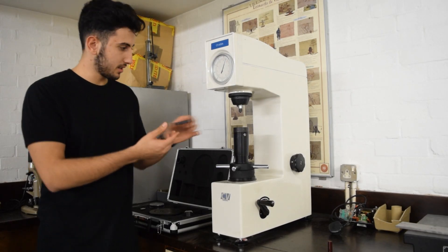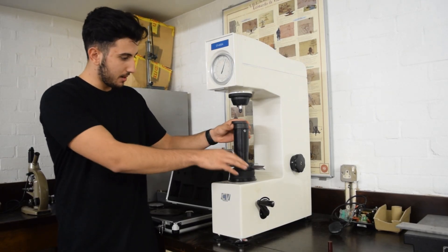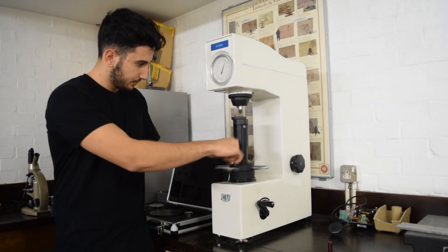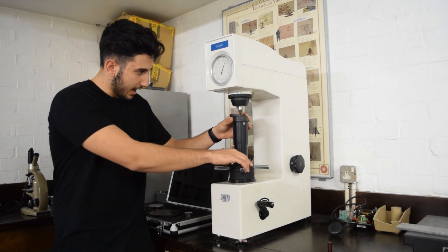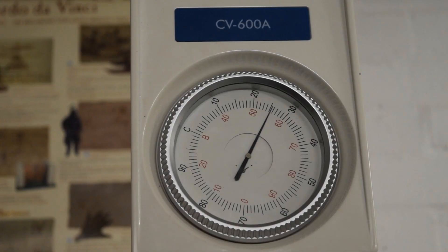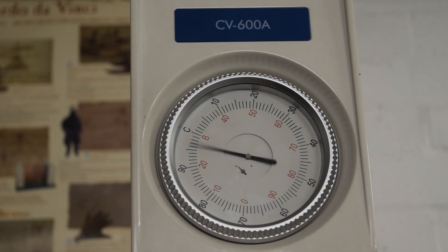Next, we'll put our test specimen onto the bench and use the feed handle to bring it all the way up to the ball indenter. Put a nice flat spot on the indenter and just let it touch the surface of the test material.